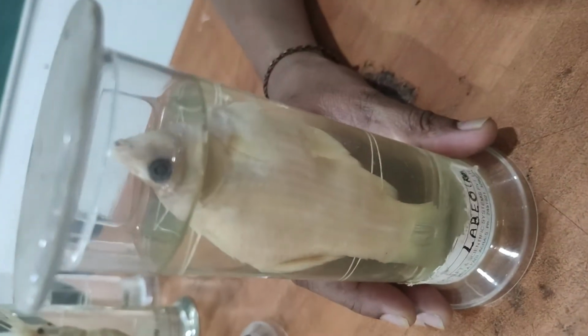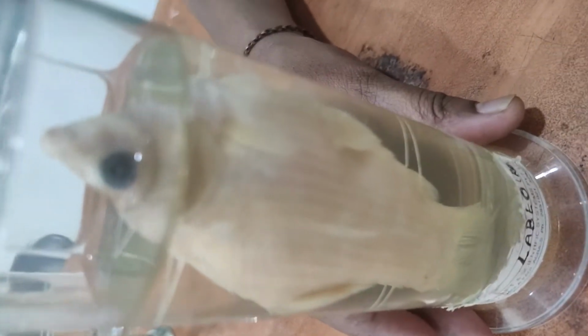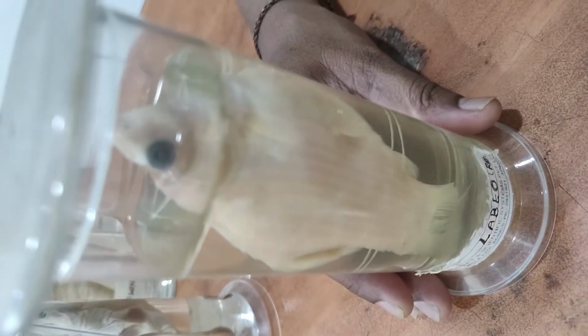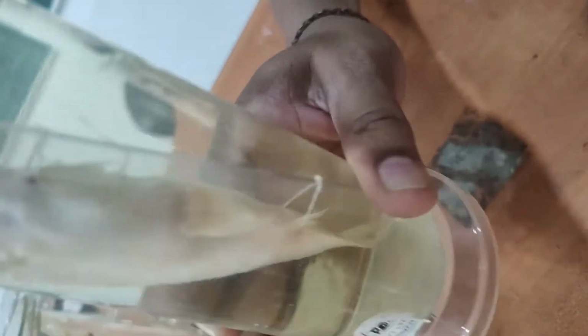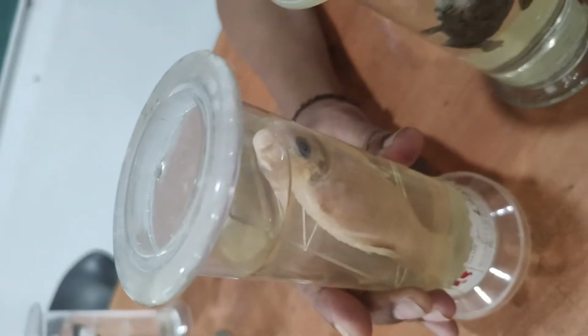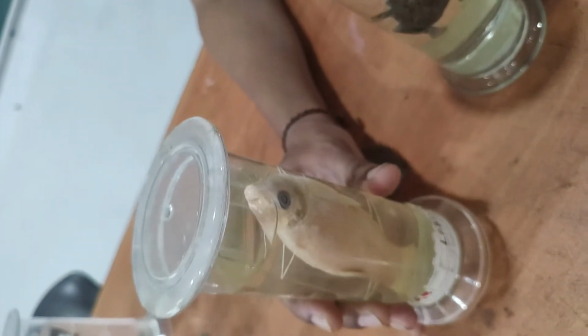Then the exoskeleton is formed of cycloid or ctenoid type of scales present on their body. The mouth is in the terminal position, you can see their mouth is in a terminal position. Then they show a single dorsal fin, they just have the single dorsal fin. Then claspers are absent in these fishes.